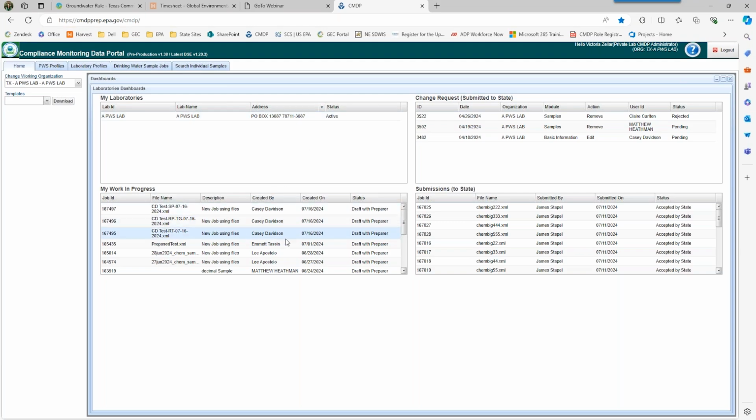Okay, great. And also, once your lab submits the required amount of error-free sample jobs, you can move into the process of registering for the production account. So then this will look different once you have, as Casey said earlier, graduated from the pre-production environment.